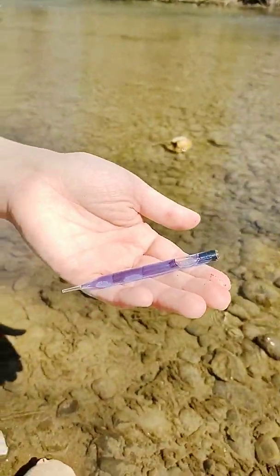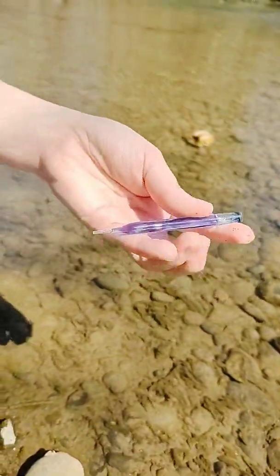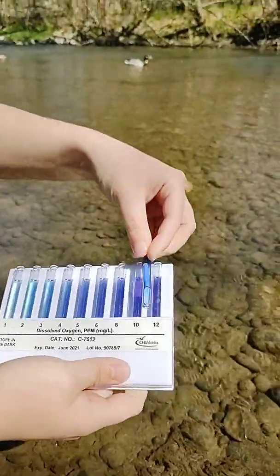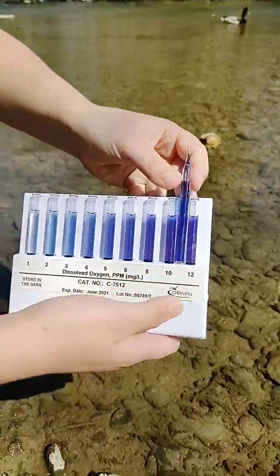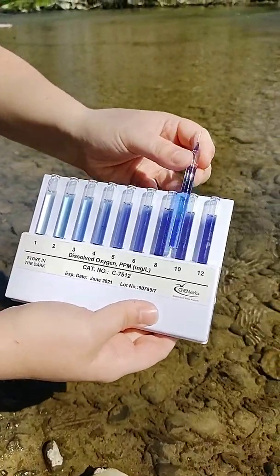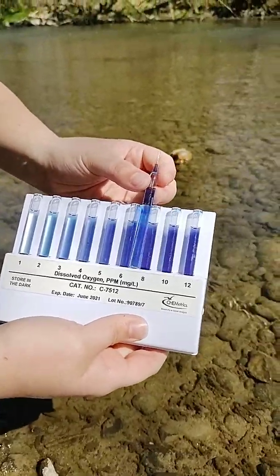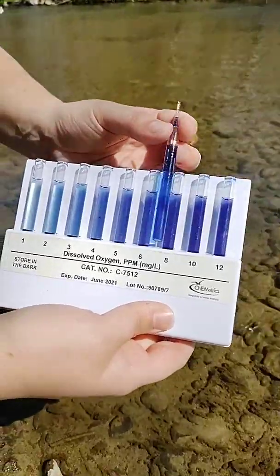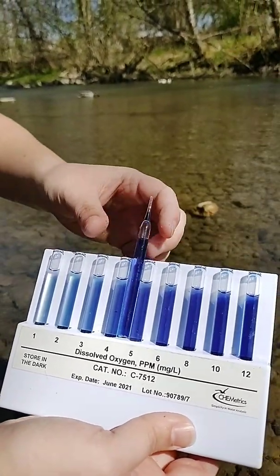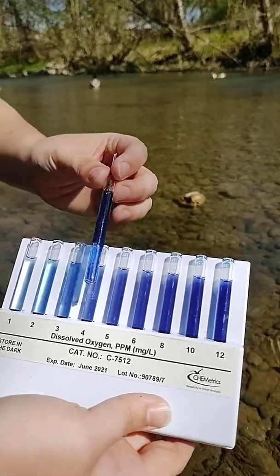So now we're going to do something similar to the pH test, where we're going to compare it to that slide you saw earlier. So here's our indicator sampler slide, and so now I'm going to put our test ampule next to the ones on the test slide. So I'll just kind of move it around so you can see what color best represents it. Move it down here. So you're just trying to match the colors the best you can. Which one you think it's the closest to.